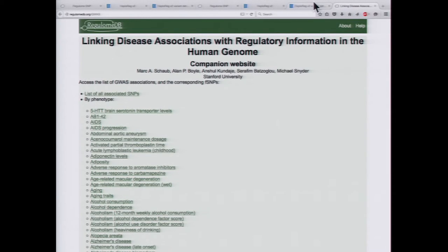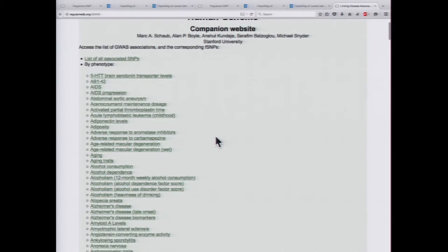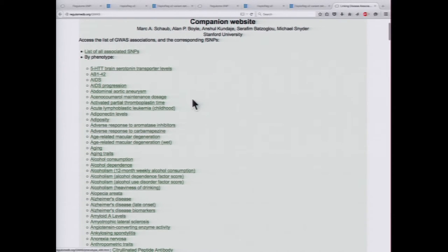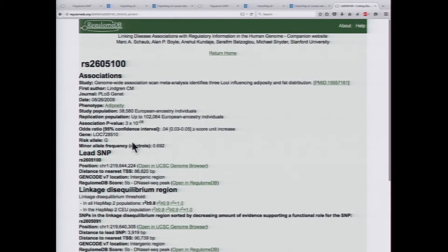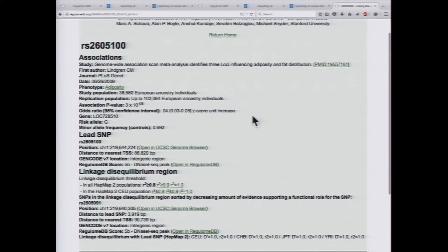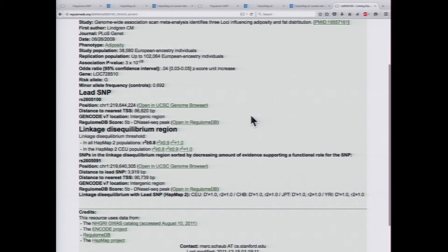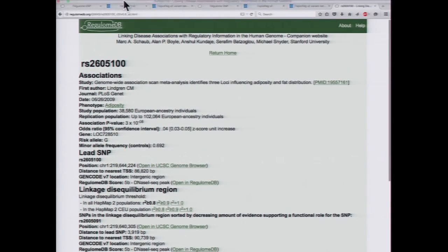RegulumDB also has its own version of curating all the variants in the NHGRI database. Here they list different diseases and phenotypes which you can click on, and it will list different variants you can explore further. It gives the RegulumDB score for the variant as well as LD SNPs in linkage disequilibrium with that particular SNP. You can search through this at regulumdb.org/GWAS.